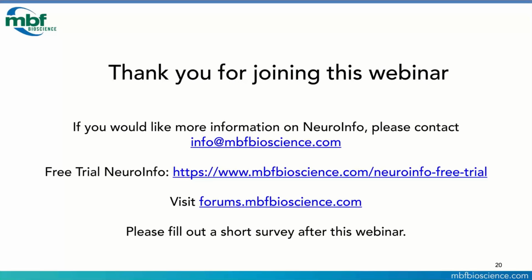So it really depends on if these other atlases have that available. Another thing that we will be making available is if you have a digital atlas, how do you get it into NeuroInfo? Because it's really just a series of images, XML files, and then an ontology in a CSV file. So we can make that available to people too if they do have their own digital resources for other species. It would be great to work on that.